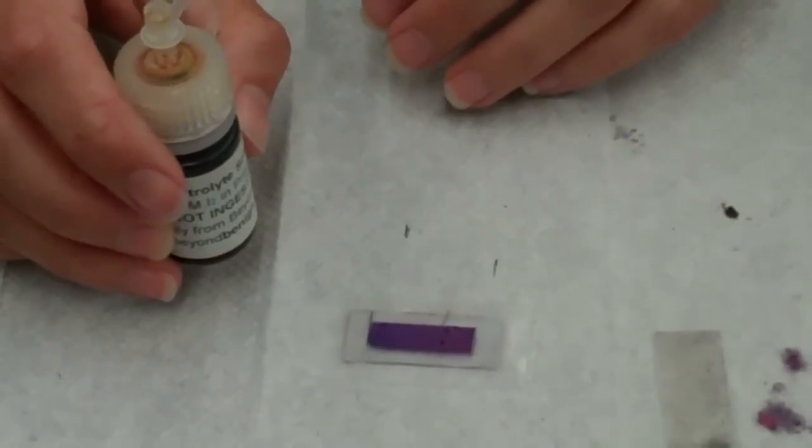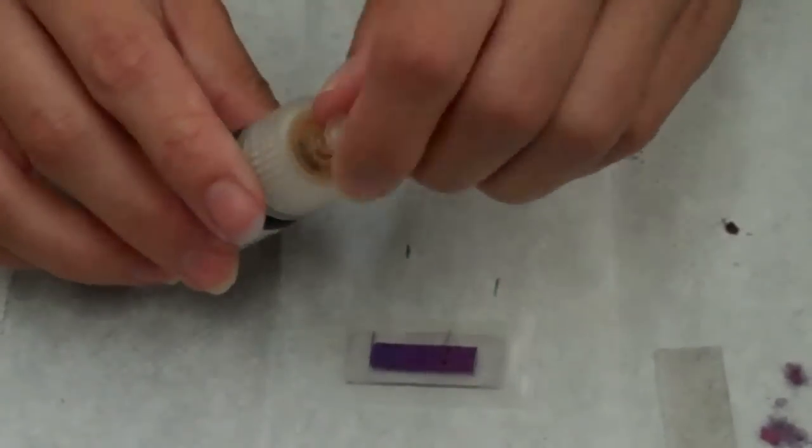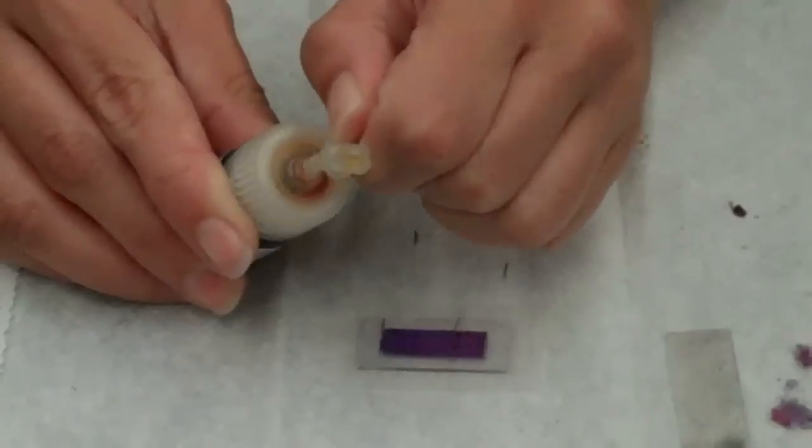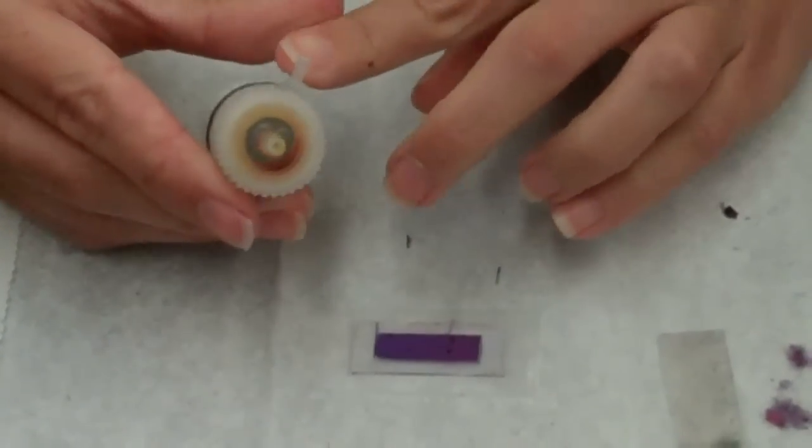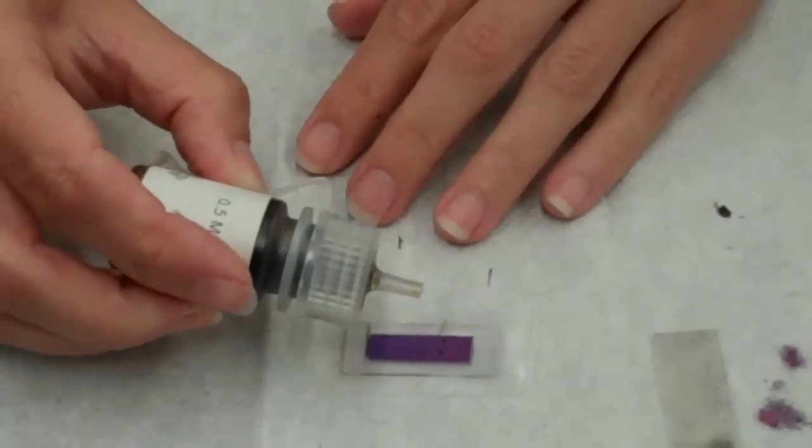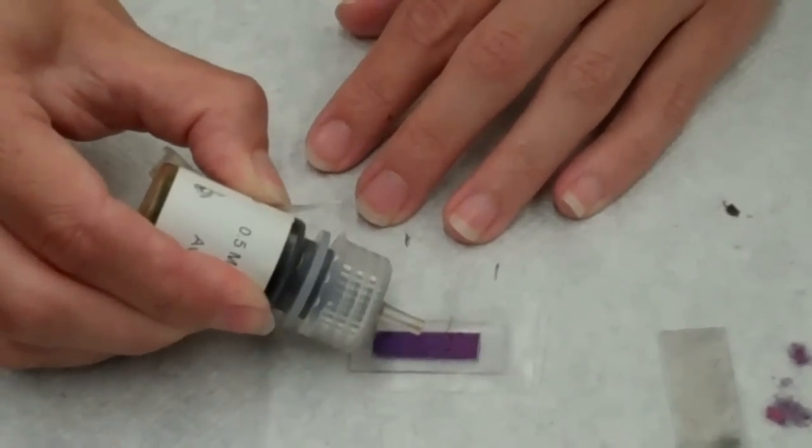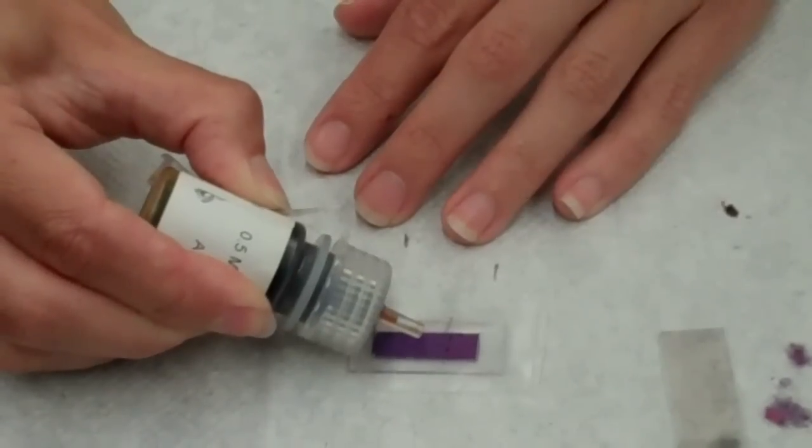At this point, you'll apply the electrolyte solution. We use a very small amount. In a dropper bottle such as this, you'll only use approximately half a drop. So the idea is to squeeze the smallest amount possible and touch it directly to the slide.